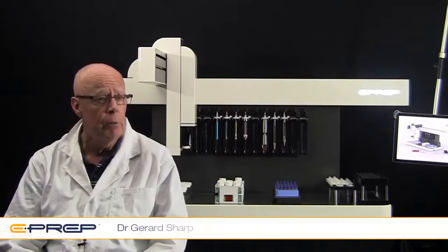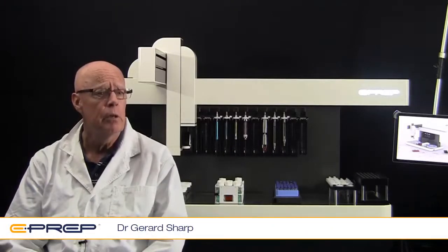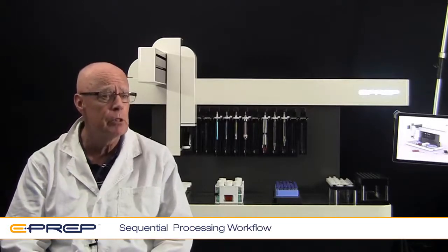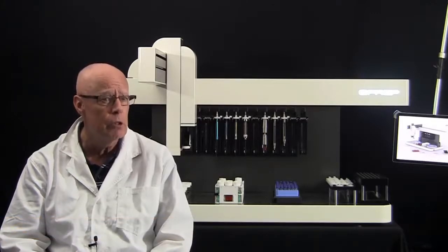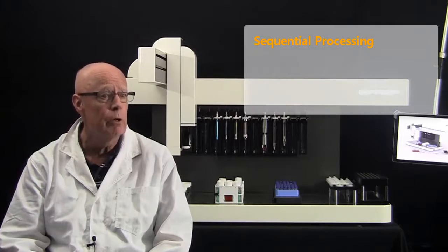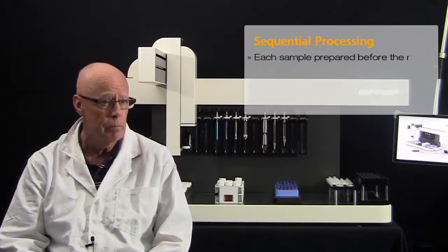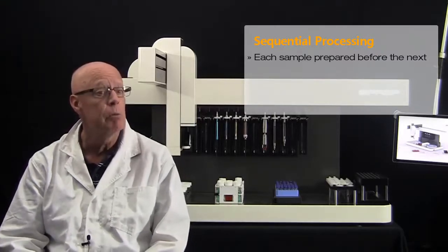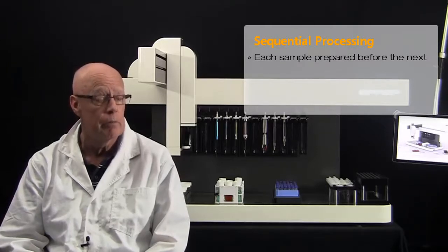In this short video, I'm going to show you how you can use the ePrep to create a sequential processing workflow. A sequential workflow describes a process where all the tasks completed by the ePrep workstation are completed for a single sample before going on to a second sample. I'll take you through the tablet software and set up each of the tasks which will define the workflow, and then finally we will see the ePrep execute this workflow.